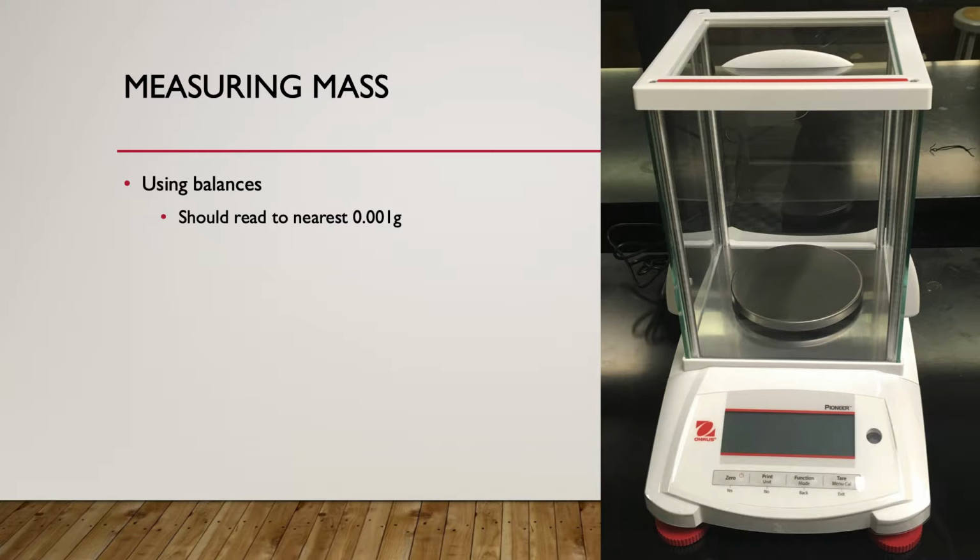And that's important from the standpoint of what are called significant figures, or significant digits. If you haven't talked about those yet in lecture, significant figures are really just a way of tracking how accurately we know things.